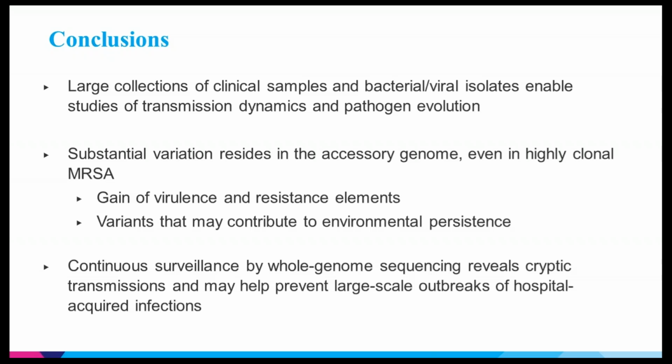And what we are working on is essentially to try and get the gap between getting these isolates and getting genome sequencing data out to be as short as possible, so that we can detect transmission events and intervene before they have a chance to grow out to much larger scale outbreaks of hospital-acquired infections.